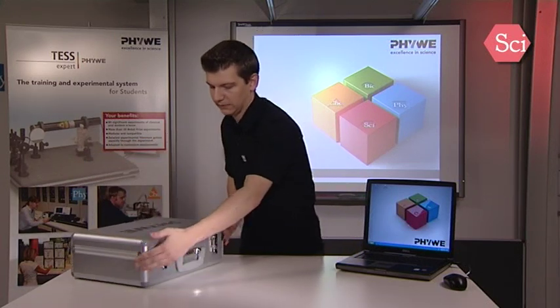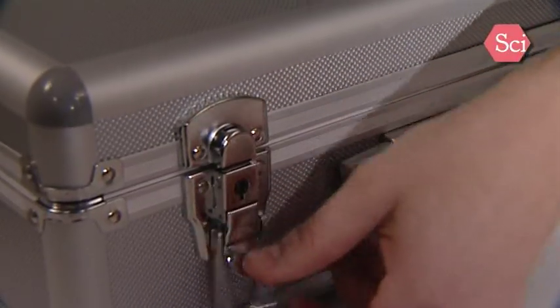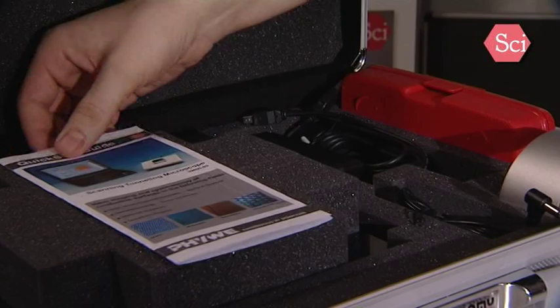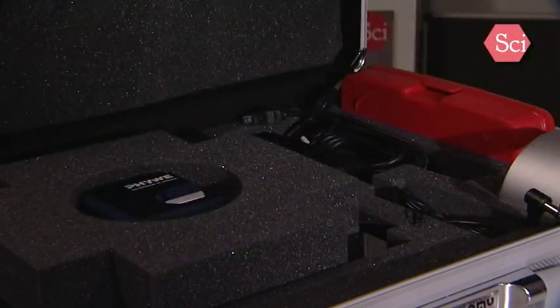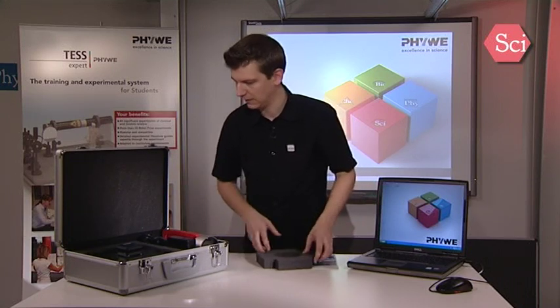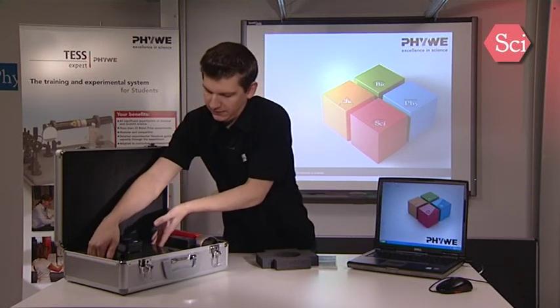Everything you need is supplied in this aluminium suitcase. We will now use the quick start guide to run through each step. We will set up the microscope, install the software, and prepare the sample and the measurement tip.